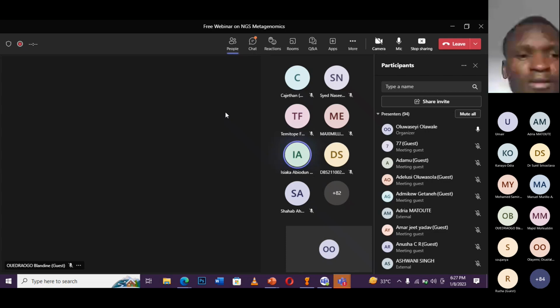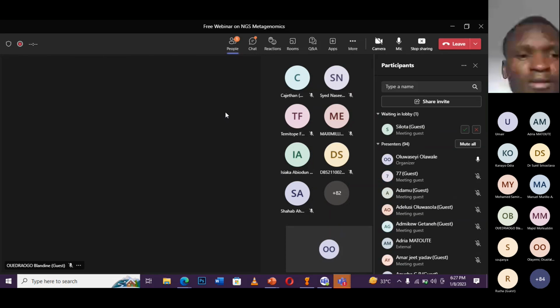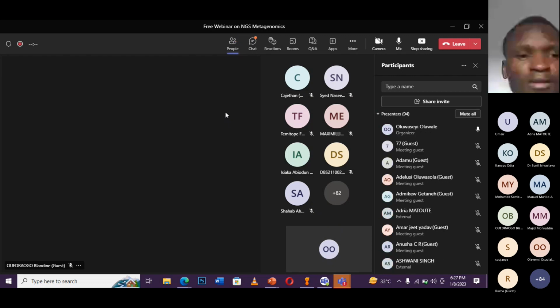The thing is, you just need to get a sample, do the culturing, and get a partnership with a particular molecular lab. After the culturing, they do the sequencing. So that is if you have a target, that is, if you are very sure that the sample you are getting contains different numbers of bacteria. Now, this is something else. This is another thing. Are you with me?